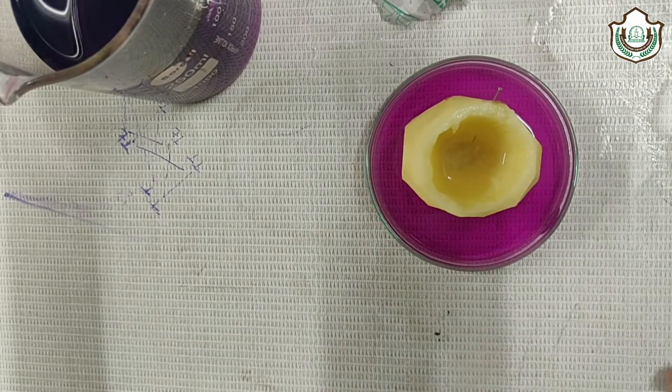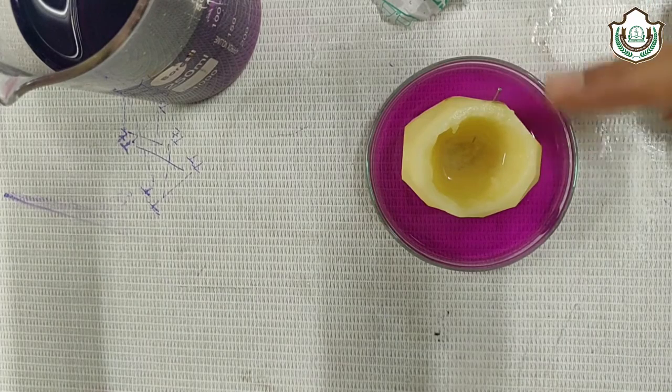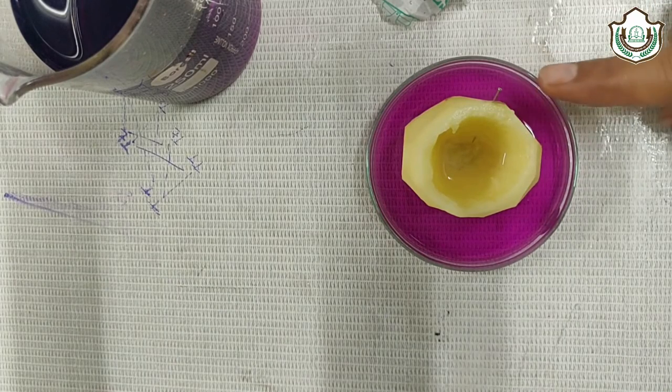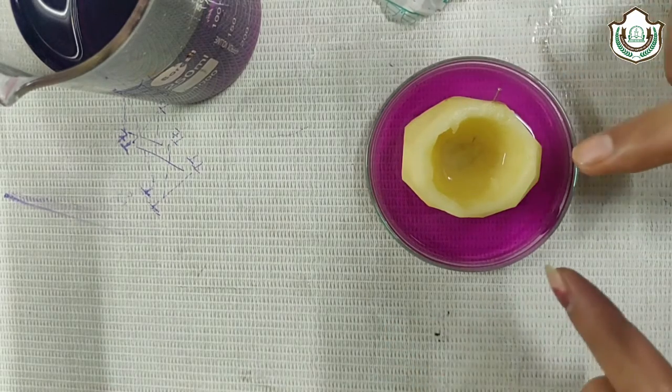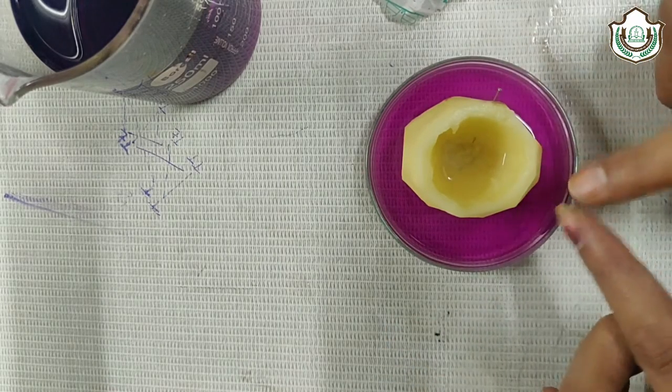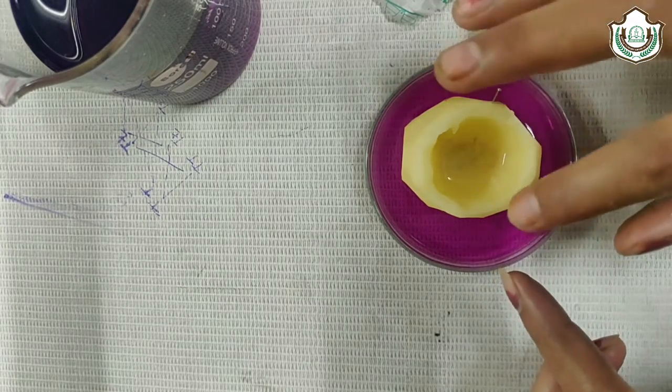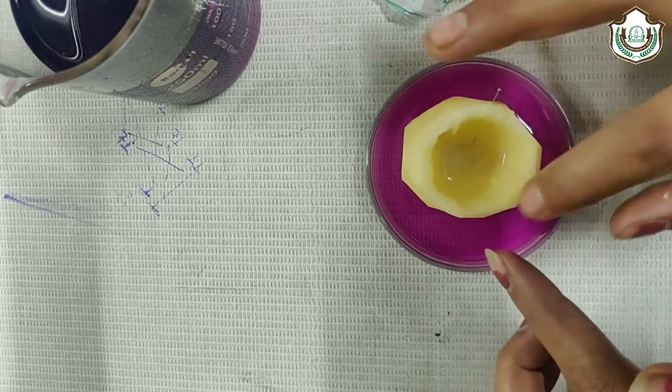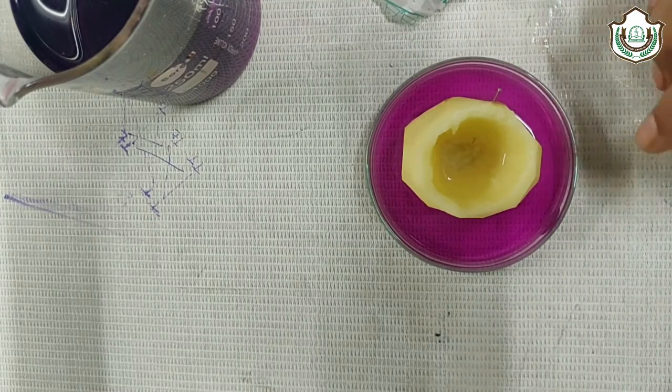After some time, you will see there is an increase in the level of sugar solution, that is sucrose solution, due to the endosmosis which takes place in potato cavity, in which the thin layer of potato acts as a semipermeable membrane. Thank you. Have a nice day.